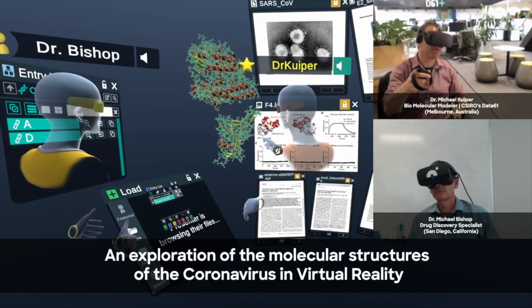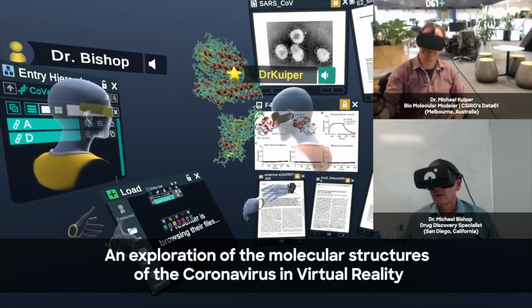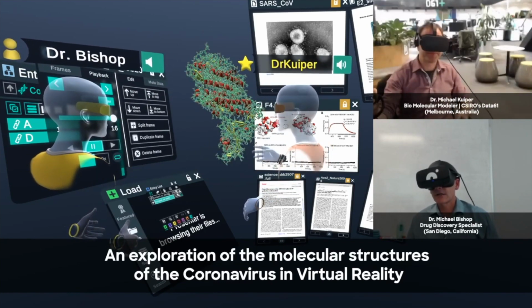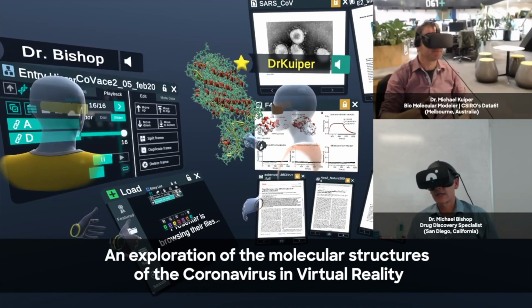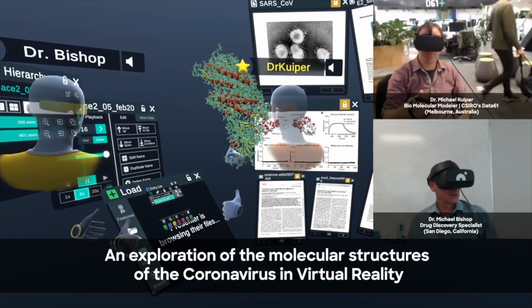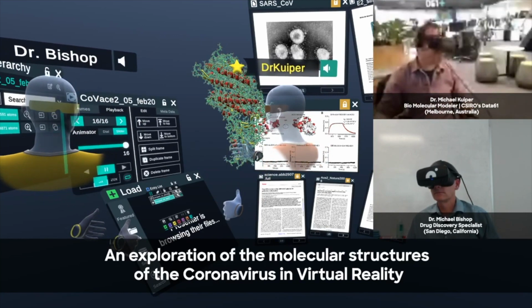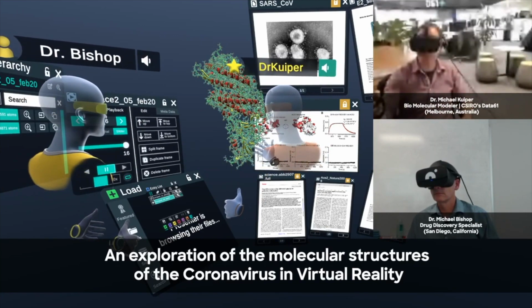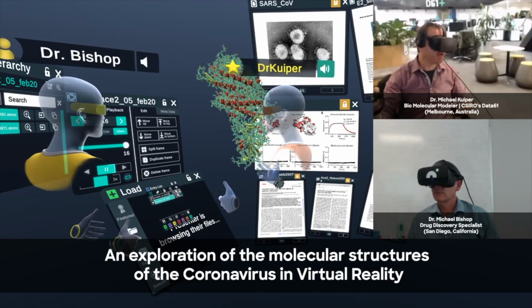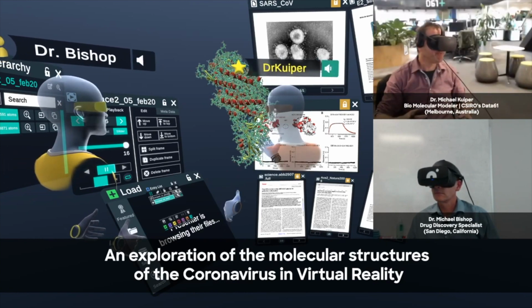Are you caught up yet? Is it working? I'm seeing the structures, but I'm not seeing, okay, now I'm starting to see the movement. Yeah, I'm seeing the frames now. Okay, I'll just give it a moment to catch up. But what I'm doing now is basically the same as we did with the previous simulation. But this is an alternative binding, which is very similar to the one we saw before.